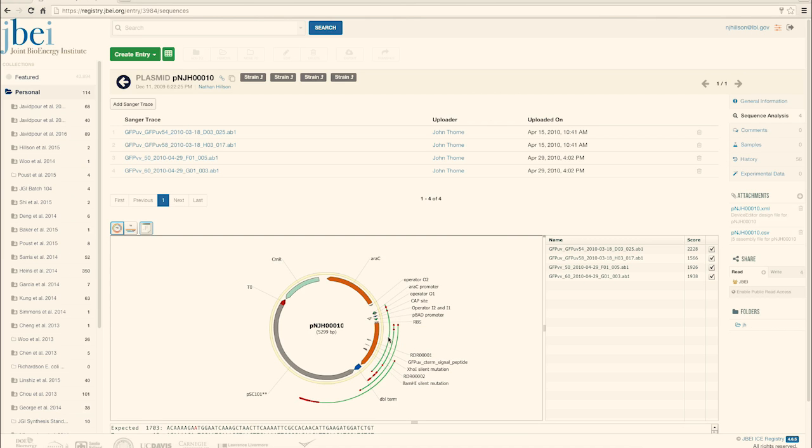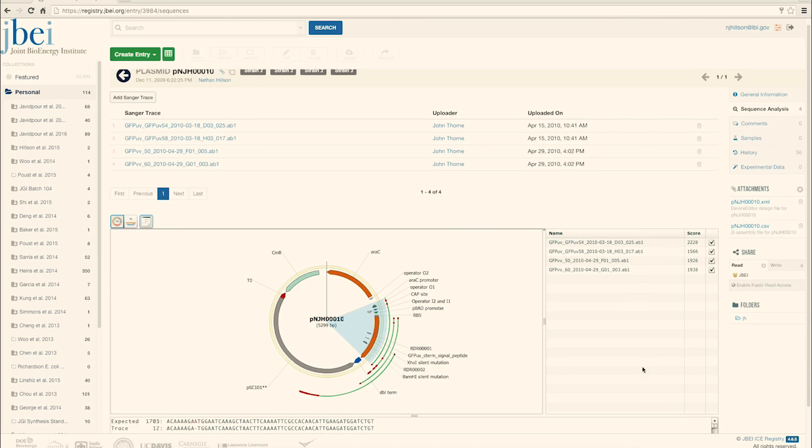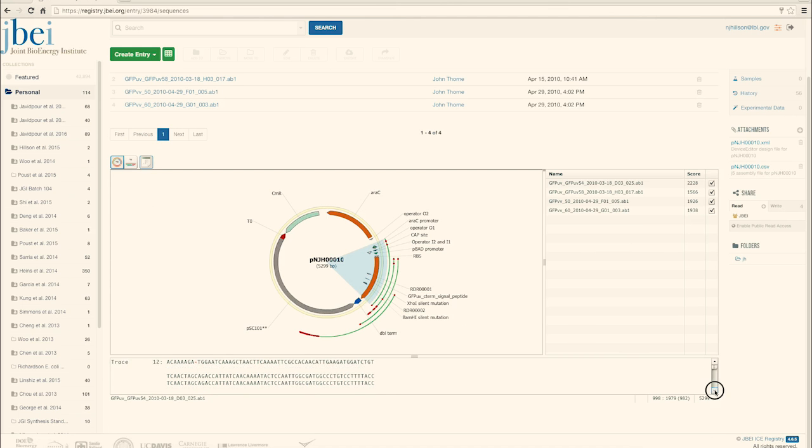And where it's green, it's good, and where it's red, there would be a particular mismatch. So if we want to get a little bit more information, you can click on one of those arcs. And if we scroll down, we can start going through the actual alignment of the expected and the query, and then you can start to see where there might be insertions, or there might be transmutations, and so on. So you can see that for each of the 4 different arcs.